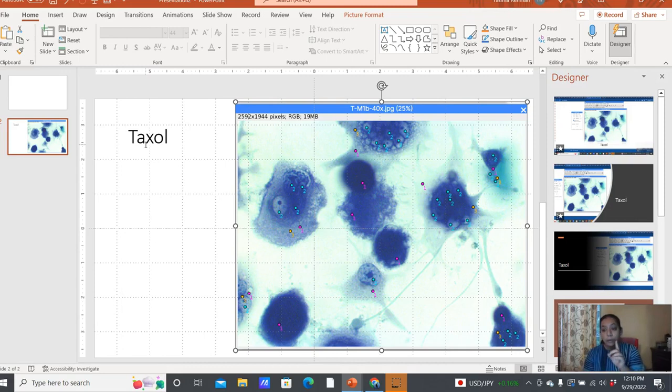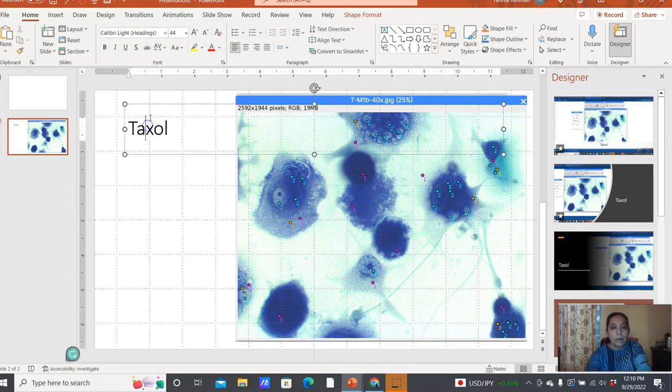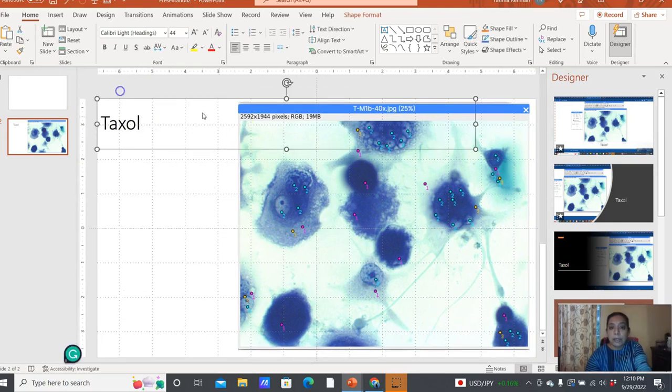You're just choosing one of your untreated to show me how you counted, one of your black mulberry, one of your Taxol, one of your saffron. So there'll be 4 slides total, each one by each of the students that are making those observations, looking at how you counted your samples, okay? And then obviously I need to have some information about these, right?